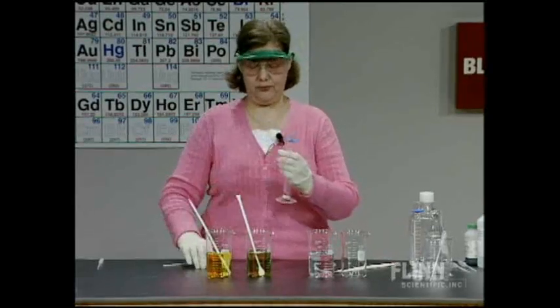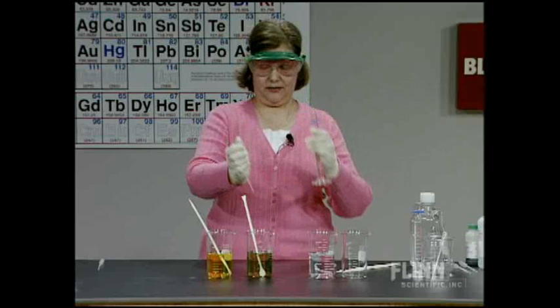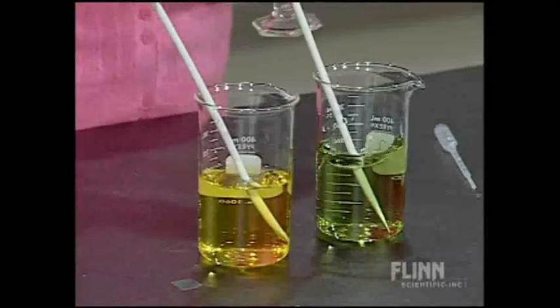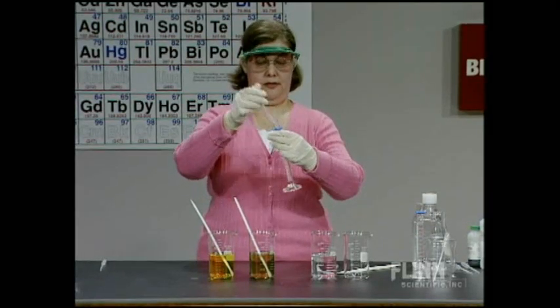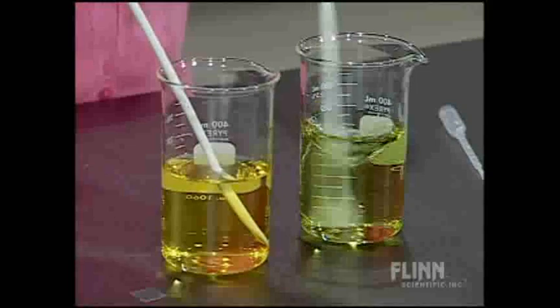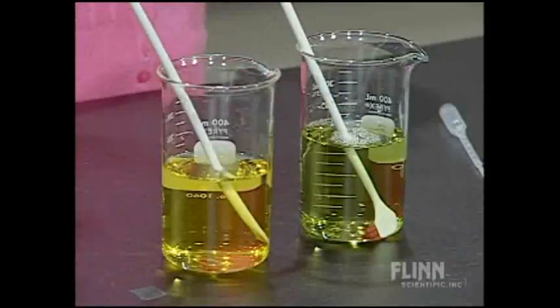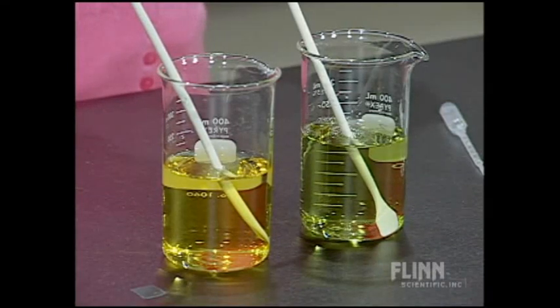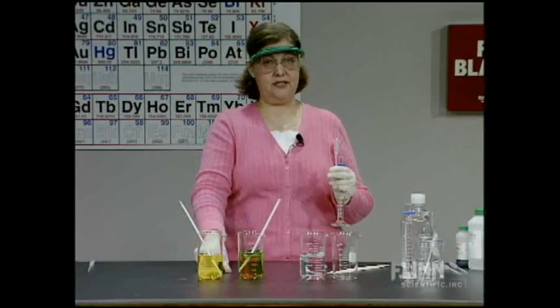Adding more acid — 8 milliliters, then 11 milliliters total. You can see a slight yellow tinge when it's first added, and maybe a slightly lighter green, but it's still in that transition range. Probably you'd say the pH has changed slightly, but it certainly hasn't dropped like the distilled water did. After about 16 milliliters of 1 molar HCl total, we finally start to match that yellow color, showing we've overwhelmed the buffer capacity.